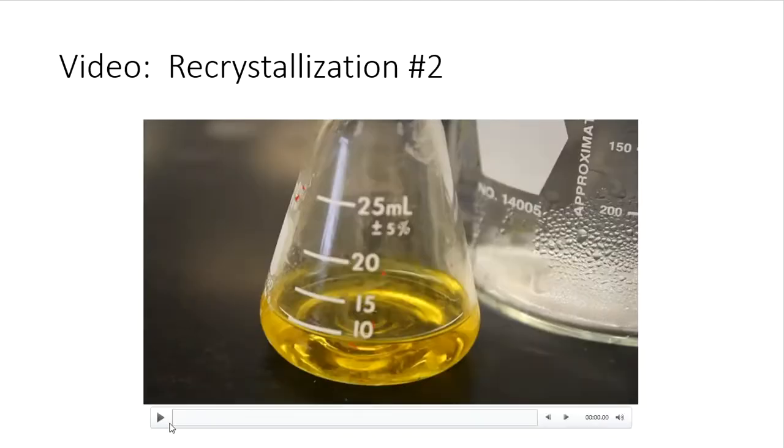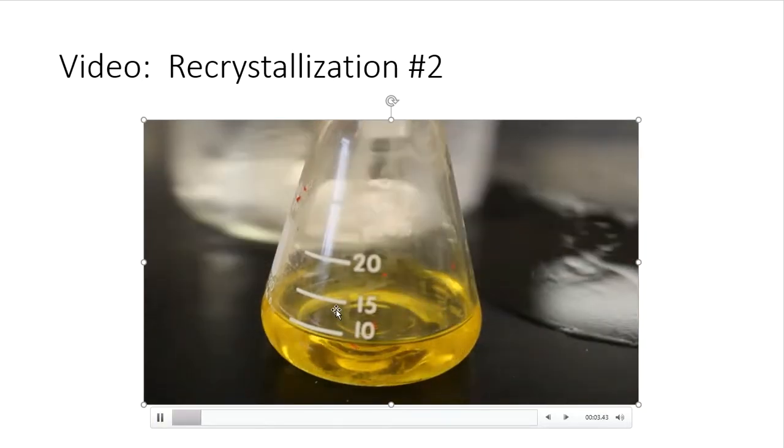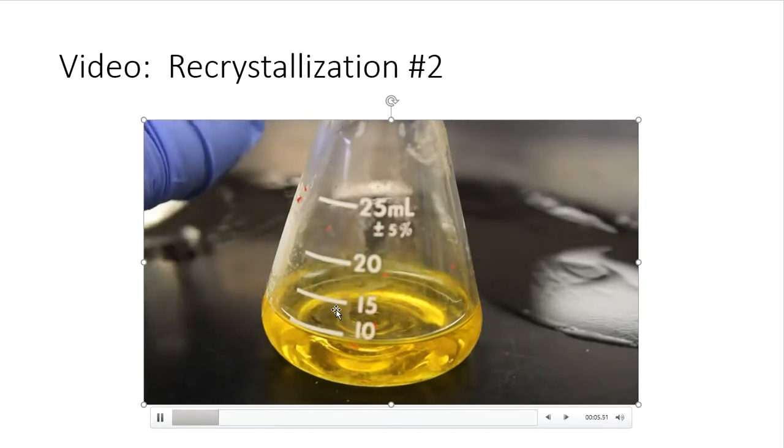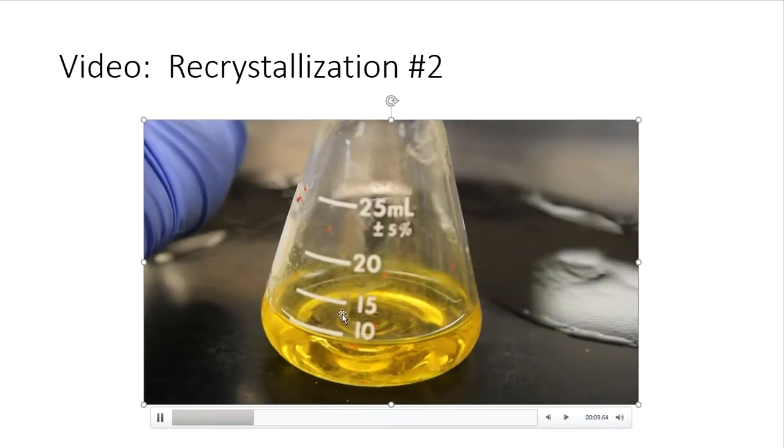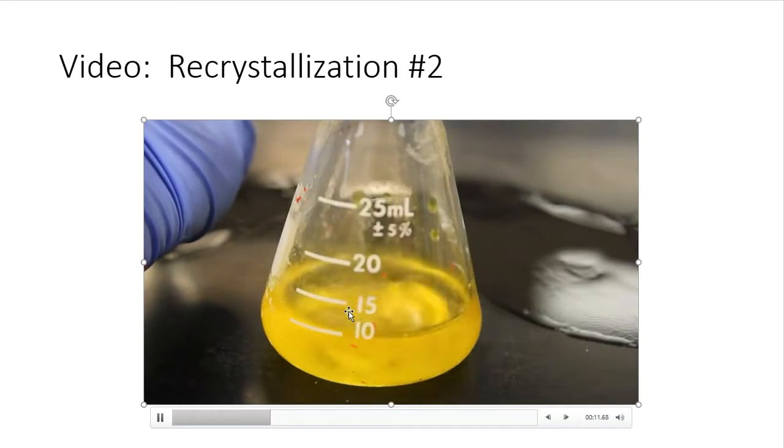It didn't fully come out of solution immediately. This one was a little bit more stubborn. So there's the flask. It's cooled to room temp. I'm going to add some cold, ice cold water. And let's hope for recrystallization.